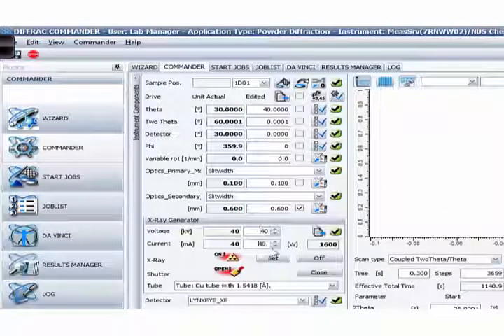The Commander behaves exactly the same as the old Commander. After a measurement is done, after five minutes the voltage and current will go to the standby settings, which is 25 kV. The standby timer — I can set it — the default is 300 seconds, meaning five minutes. This is the same as the old D5000 software.